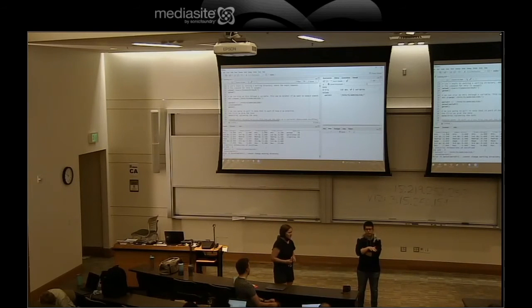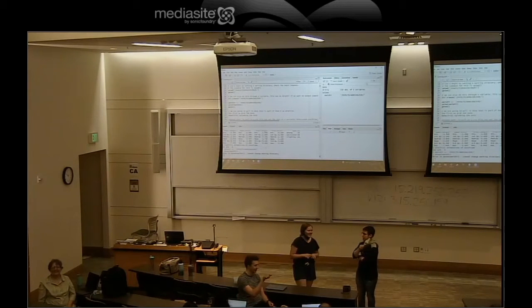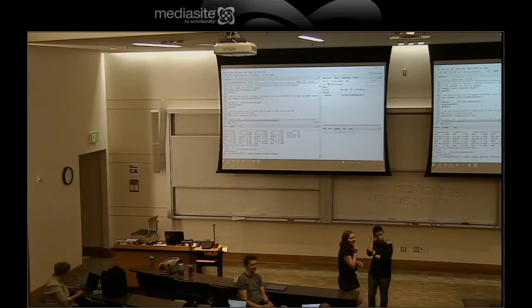If you're really having issues, remember this is on your computer, you can just make the folder like normal. Try it on the command line first, but sometimes you just gotta do what you gotta do. You don't need to reinvent the wheel.